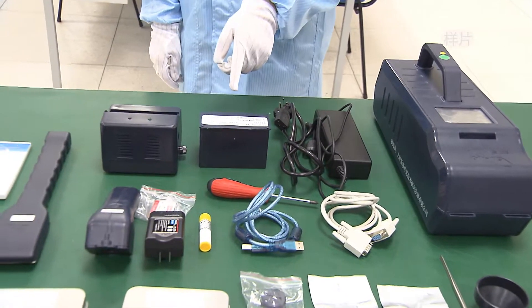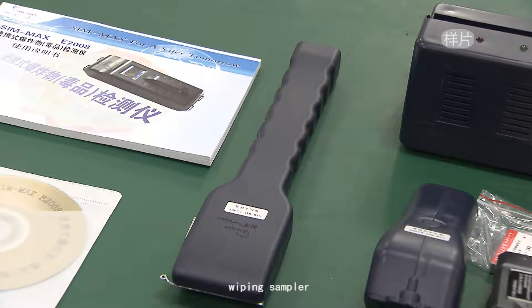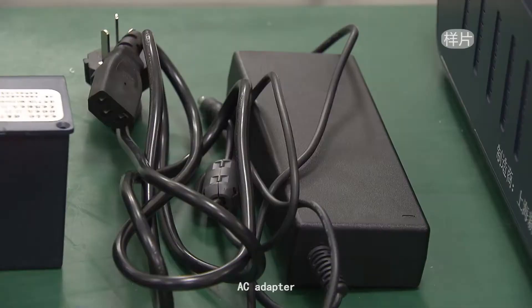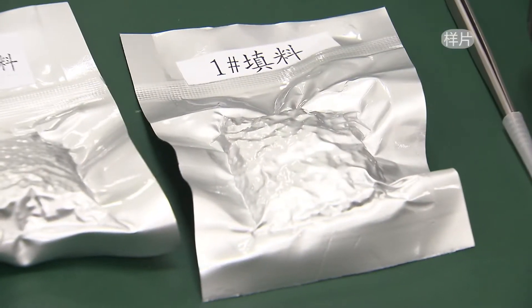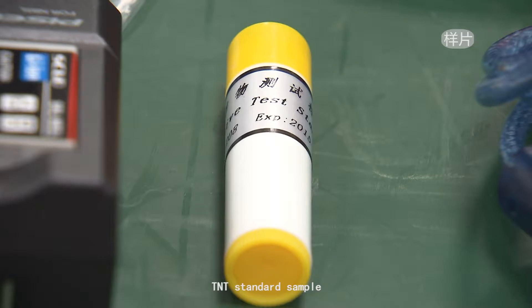Accessories included: battery, charger, wiping sampler, wiping paper, air breathing sampler, air breathing paper, AC adapter, desiccant, funnel, tweezer, purge line cover, O-rings, and TNT standard sample.